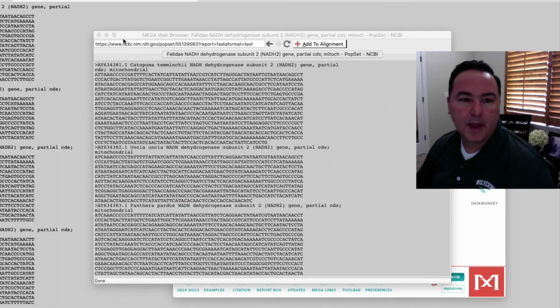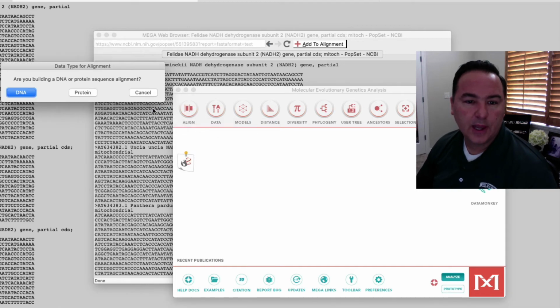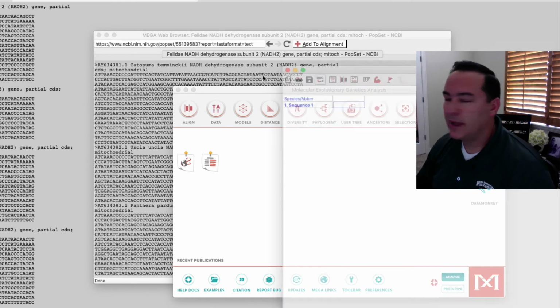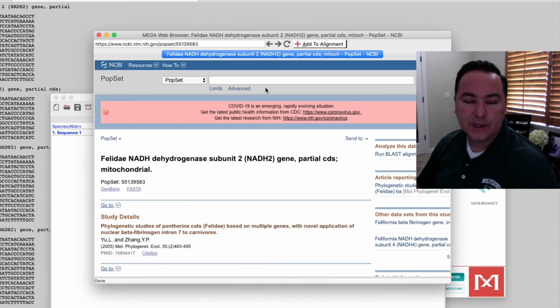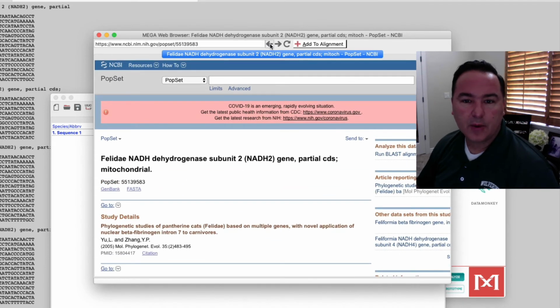And then I'm going to come back to building a new alignment, create a new alignment, DNA. Okay, so now I'm building another alignment here, and I'm going to go back to this web page where I was at using the Mega browser, right? And now I'm going to go back one more.